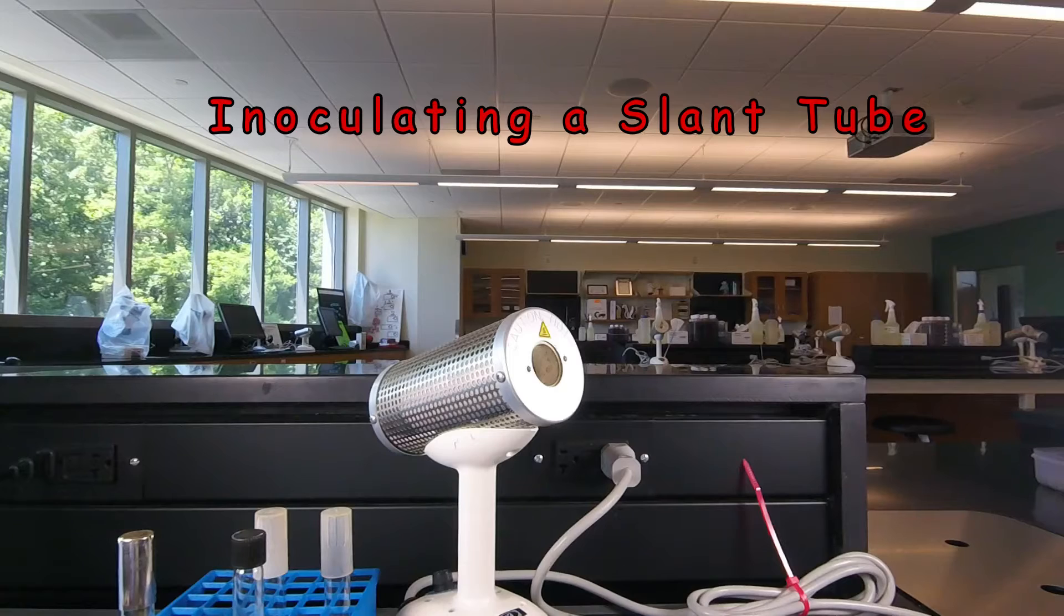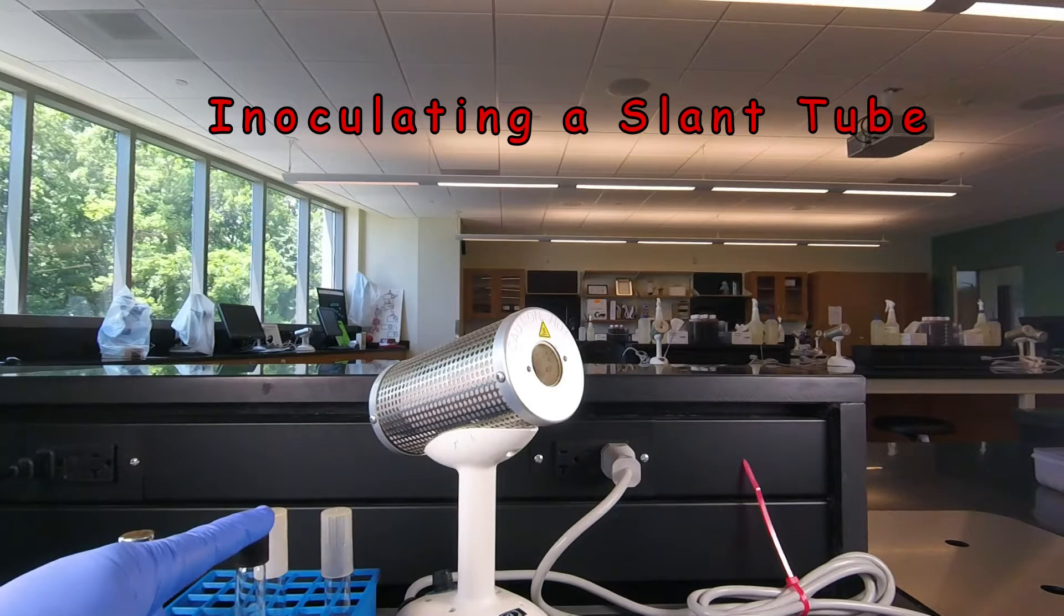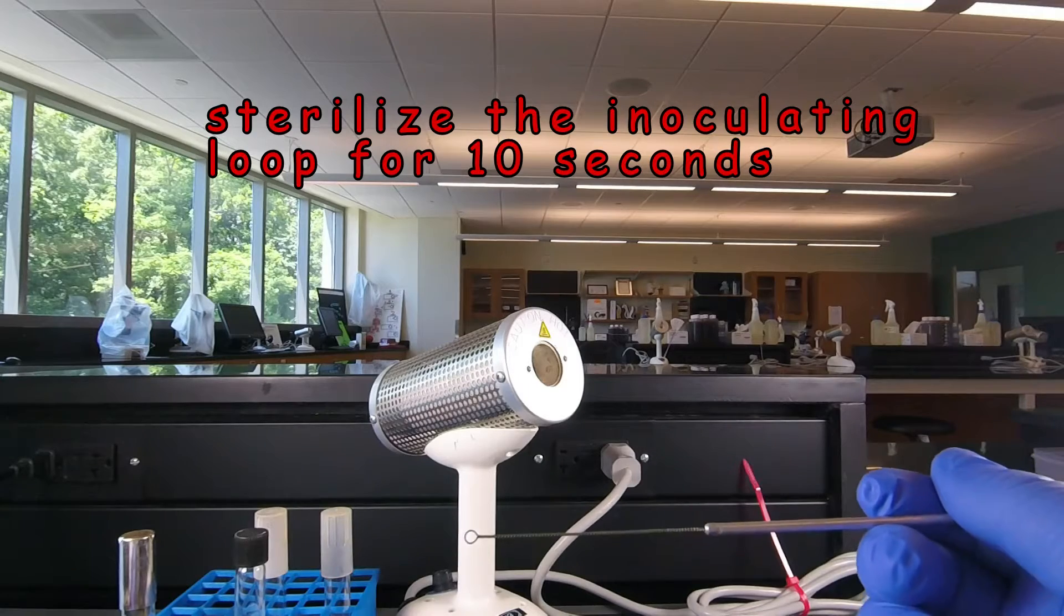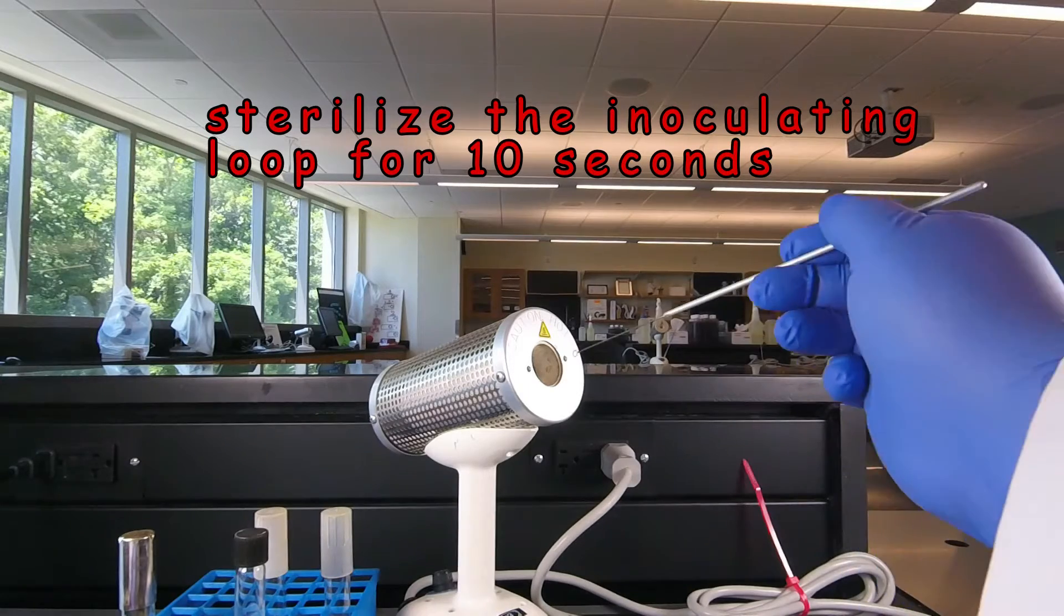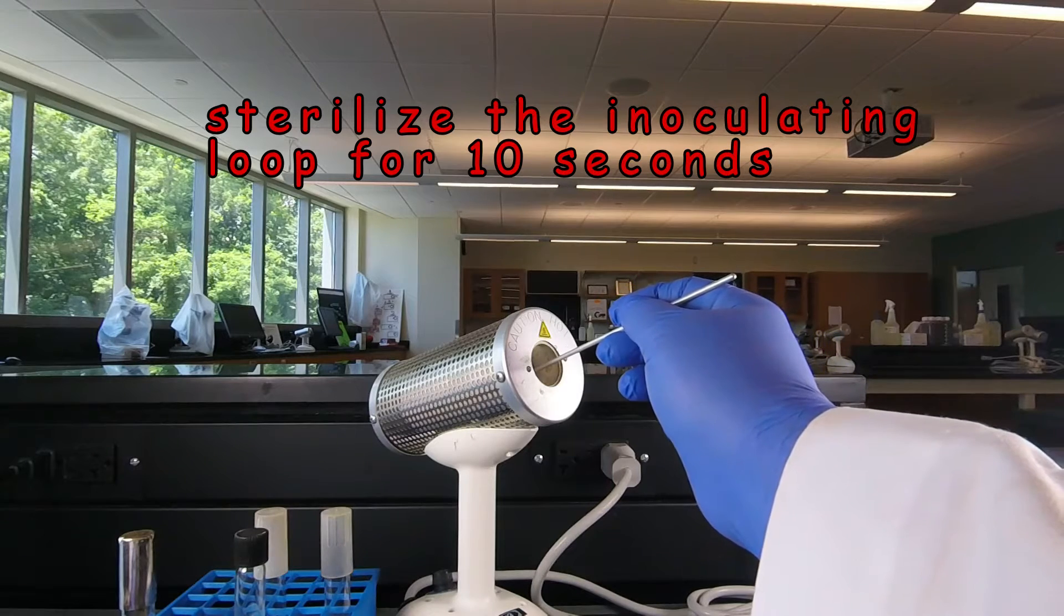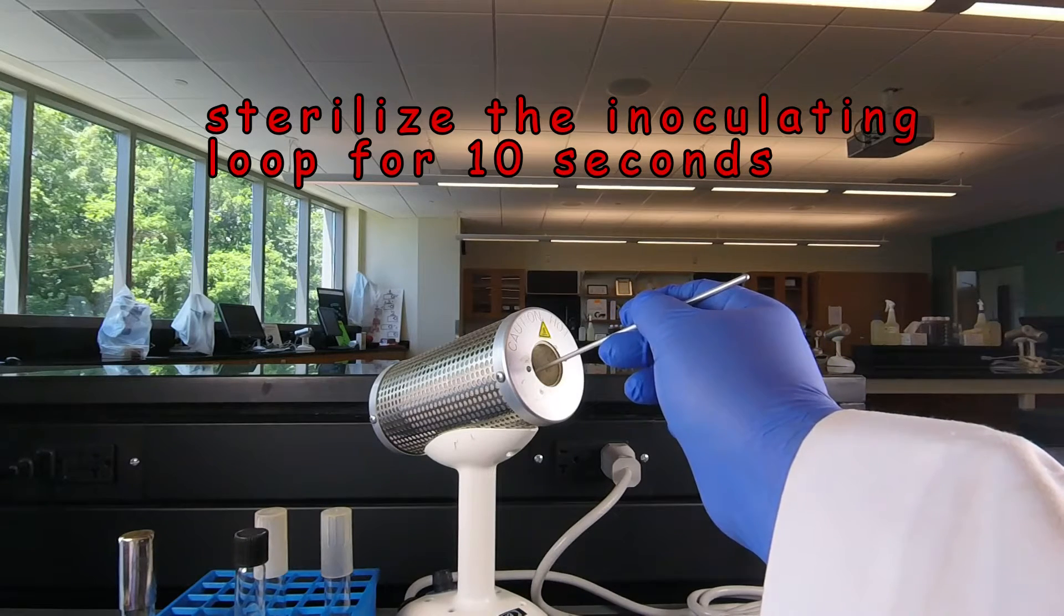We also want to grow our bacteria in a slant tube. So we start out the same way. We always sterilize the inoculating loop before we do anything. Put it all the way into the Bacto incinerator until the handle is just inside the glowing part. Ten seconds.